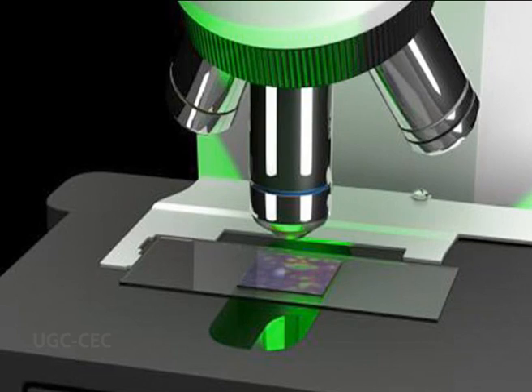Place the slide in the jar and stain at room temperature for about 50 minutes. Remove slides, rinse by dipping a few times into plain buffer, then stand on end to dry. There is no need to cover slip the slides. Immersion oil can be placed directly on the smear for observing various blood cells under the microscope.